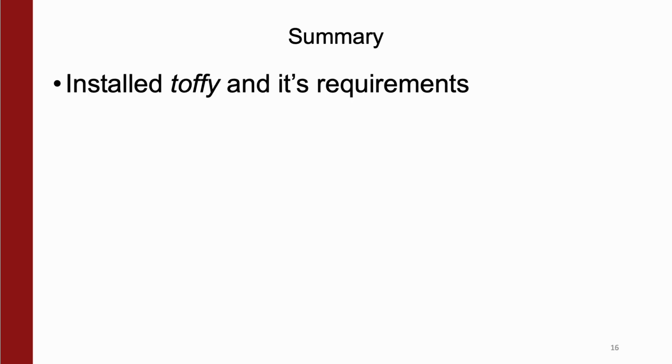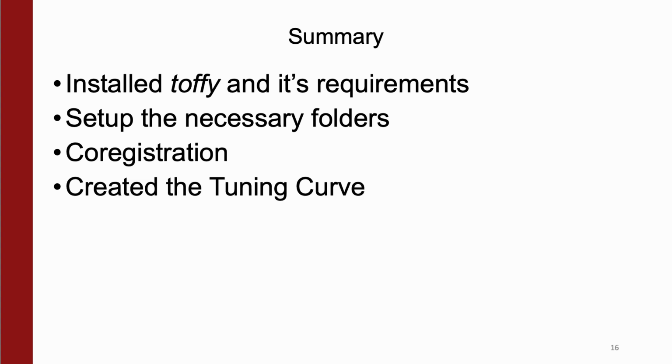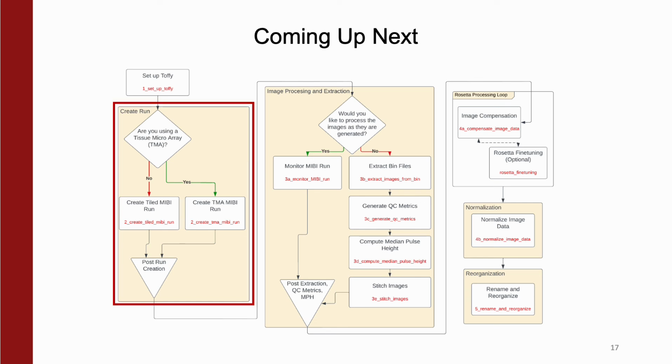In summary, we have now installed Toffy and its requirements. We've set up the necessary folders on the CAC to allow for easy processing. We've set up co-registration, and then we've created the tuning curve. Coming up next, we'll be looking at how to create a run.